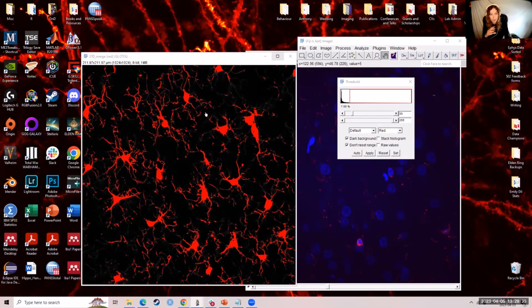So the workflow that this is coming from was actually a bright field workflow where we had the capability of taking stacks that were stitched at 100x. So we had hundreds and hundreds of cells. So we're able to look at a lot of morphology at once. So yes, definitely making sure you know why you're doing it and what the output is before you start designing something is a very good way to go.